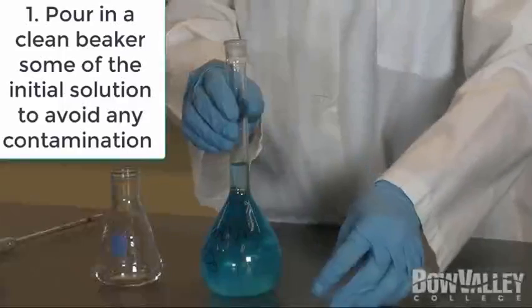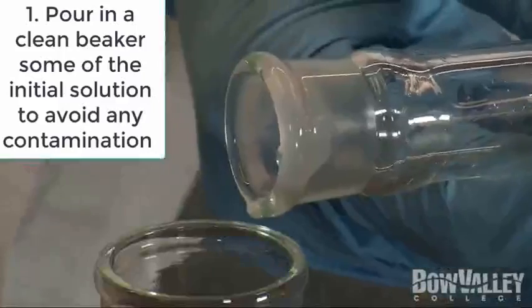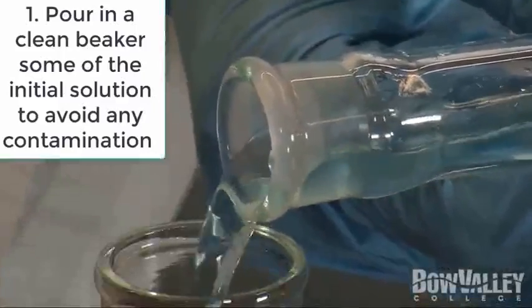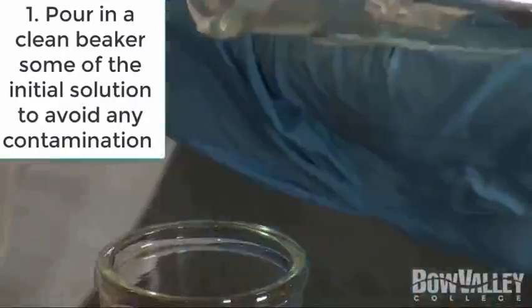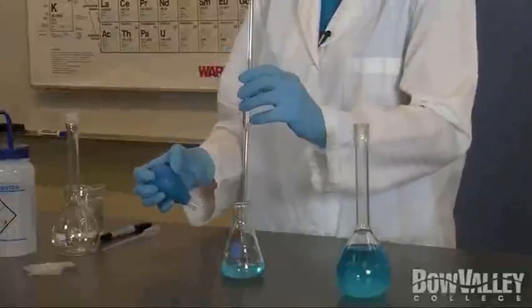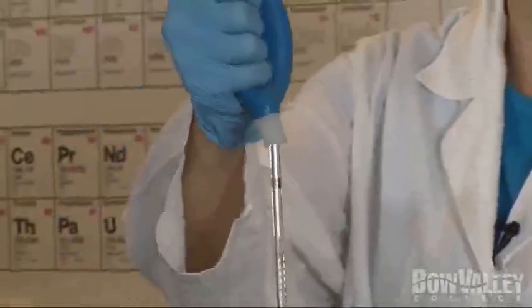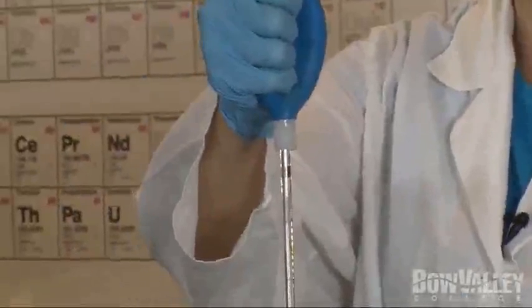Here's our stock solution. We do not want to contaminate it by directly inserting our pipette, so a small amount is first transferred to an Erlenmeyer flask. To use the pipette, place the end in the liquid to be collected. Squeeze the pipette bulb, then securely place over the end of the pipette.